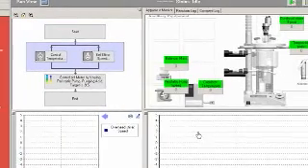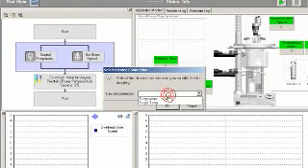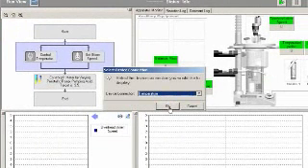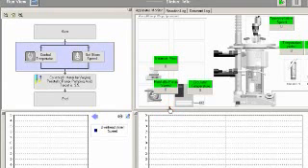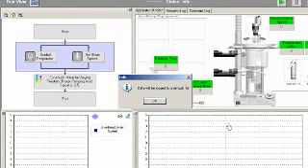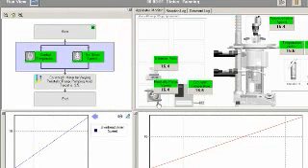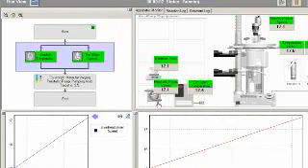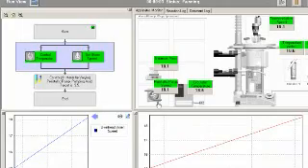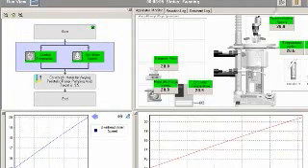During the reaction, the ATLAS software allows responses to be continuously monitored and graphed with easy to use alarms and emergency control. Experiments can be modified on the fly and all reaction data is continuously logged to CSV data files making analysis very easy.